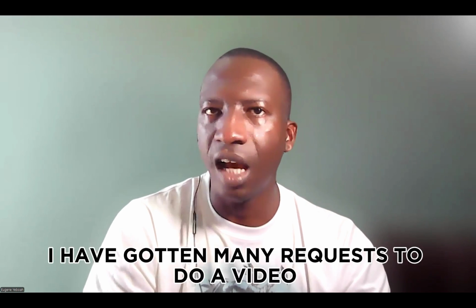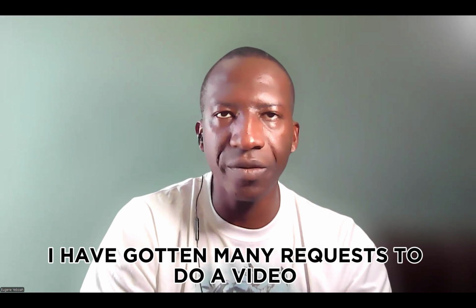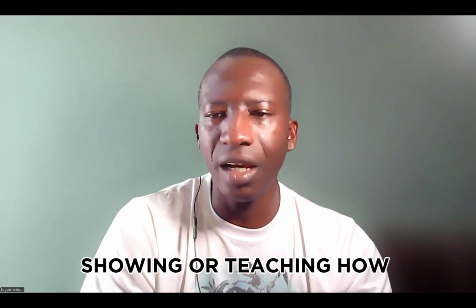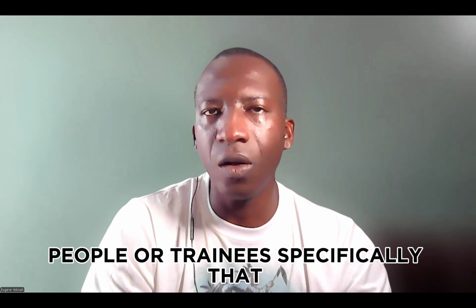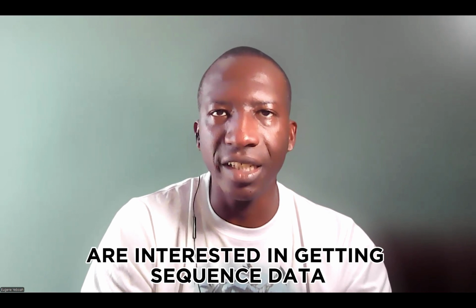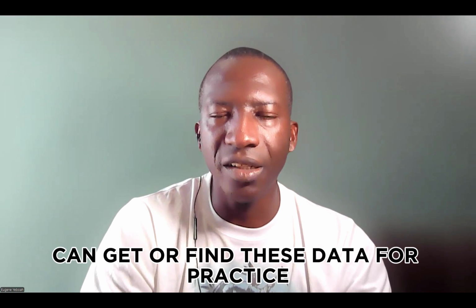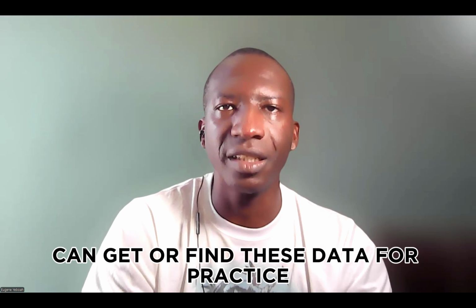I have gotten many requests to do a video showing or teaching how people or trainees that are interested in getting sequence data can get or find these data for practice.